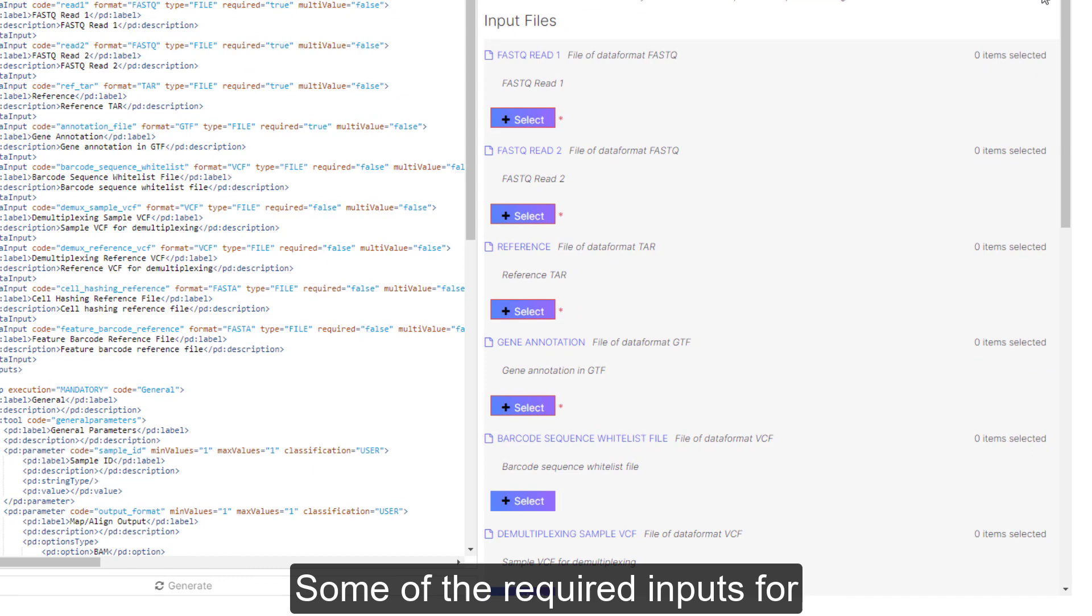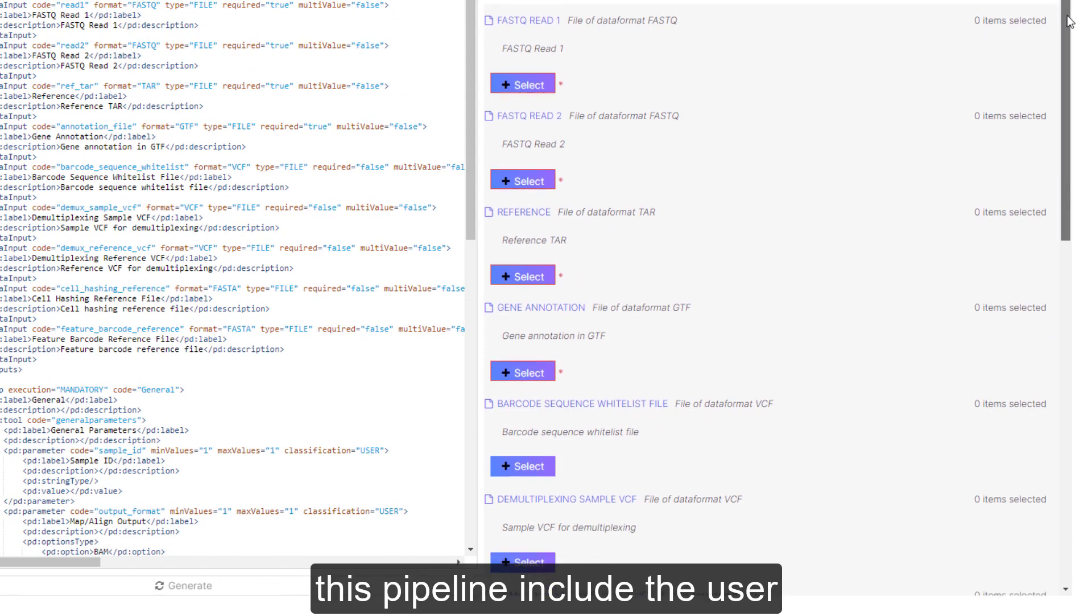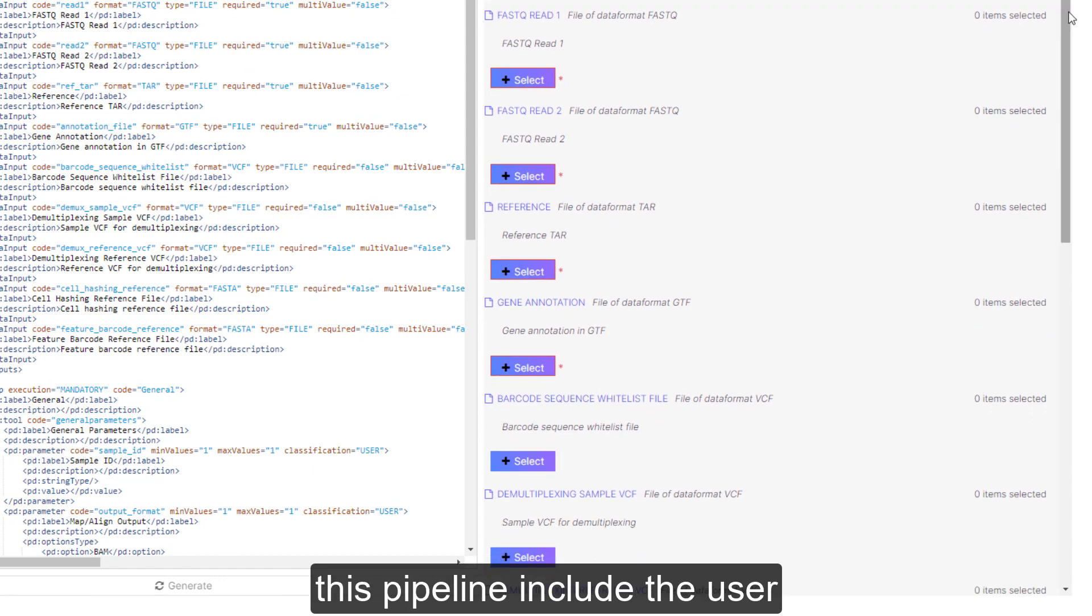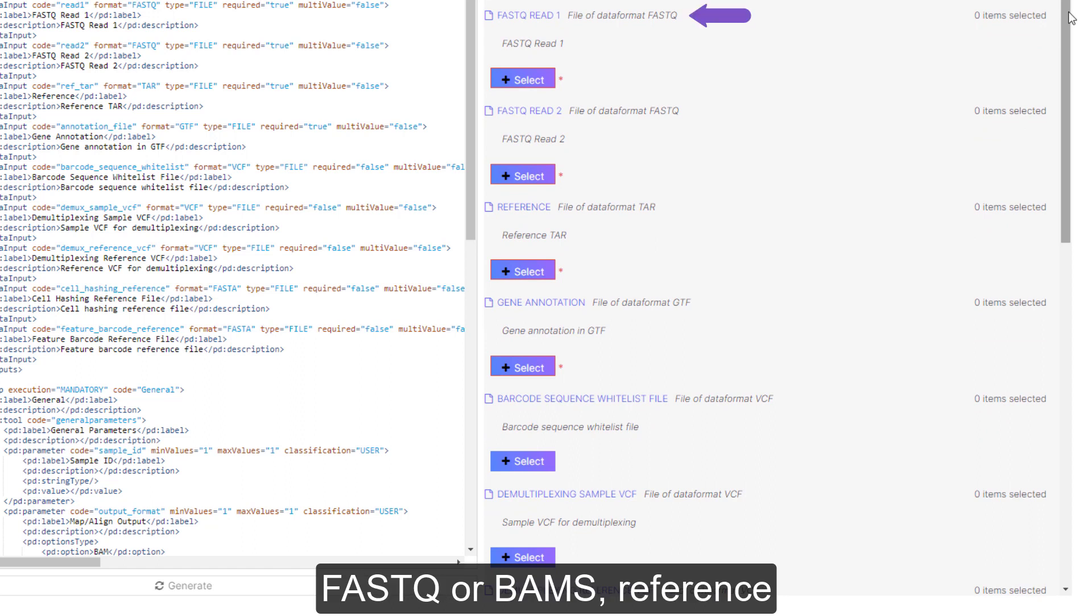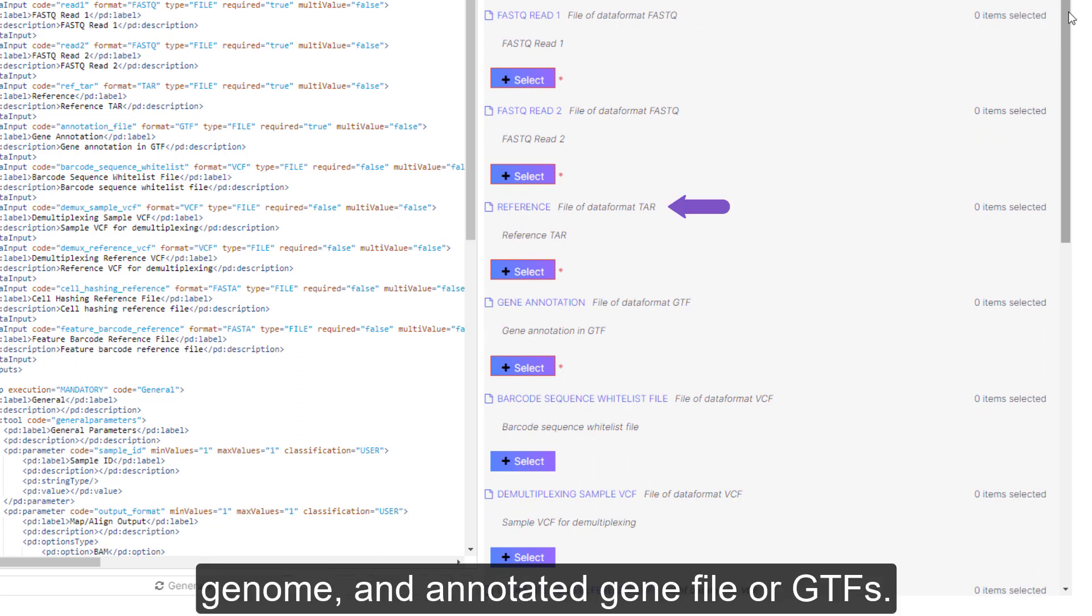Some of the required inputs for this pipeline include the user reference or analysis name, FASTQs or BAMs, reference genome, and annotated gene file or GTFs.